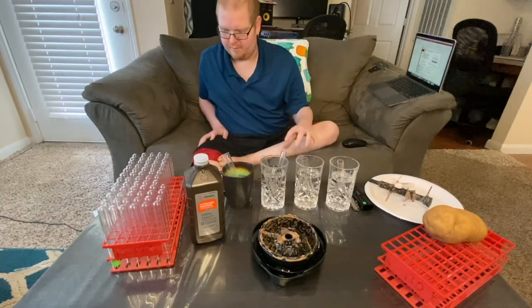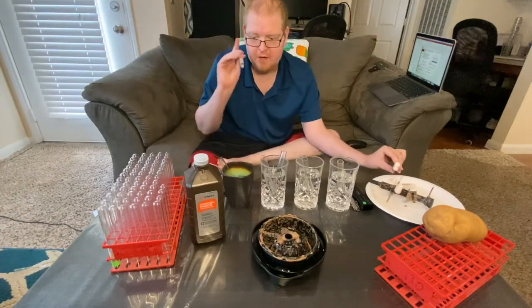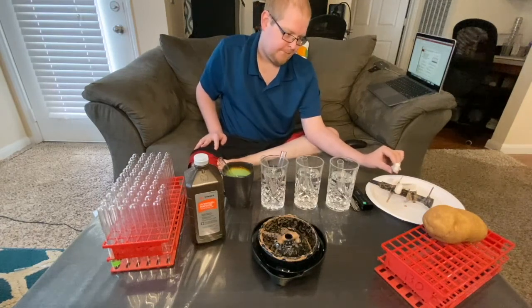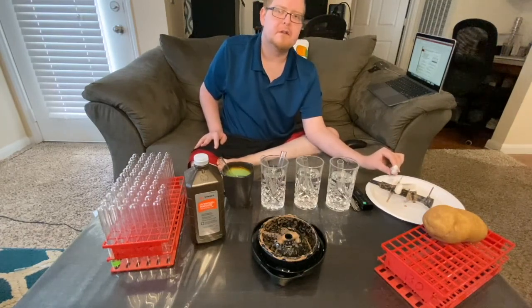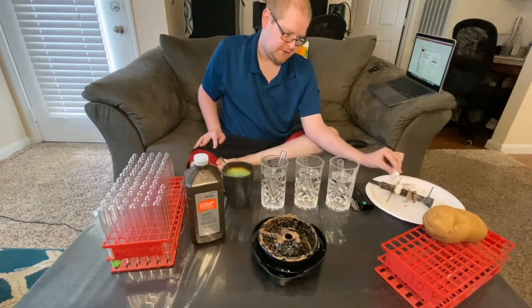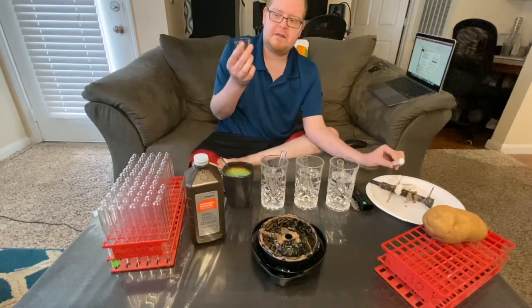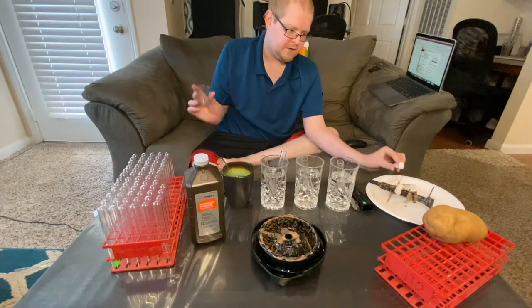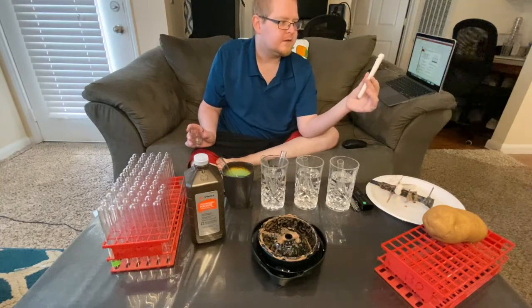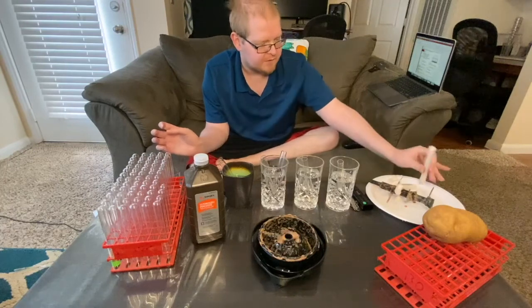You can even try it in the hot water. I'm not really sure what that's going to do, but depending on how much hydrogen peroxide you use would depend on how the reaction occurs. I may have used too much hydrogen peroxide. Also, if you use bigger glasses, it's probably not going to bubble up this much. I used a relatively small space for it to occur.